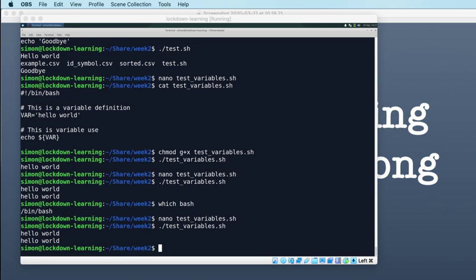Environment variables are used for lots of different things. One of them is the path, which I'll come to in a minute, that is useful to the system in various ways. But I'm going to talk about a couple of others first. One of which is home, $home.